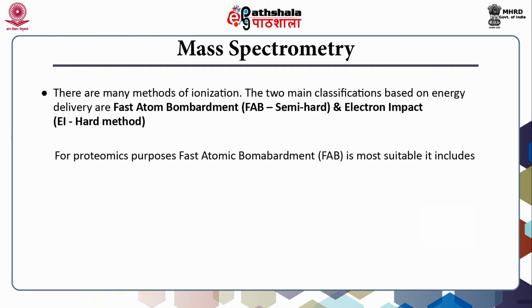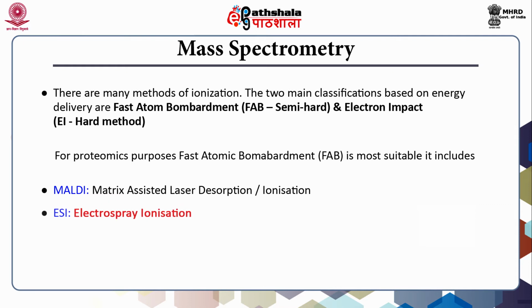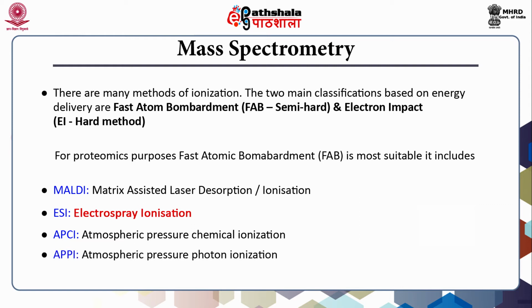This includes MALDI, that is matrix assisted laser desorption ionization, ESI electrospray ionization, APCI atmospheric pressure chemical ionization, and APPI atmospheric pressure photon ionization.